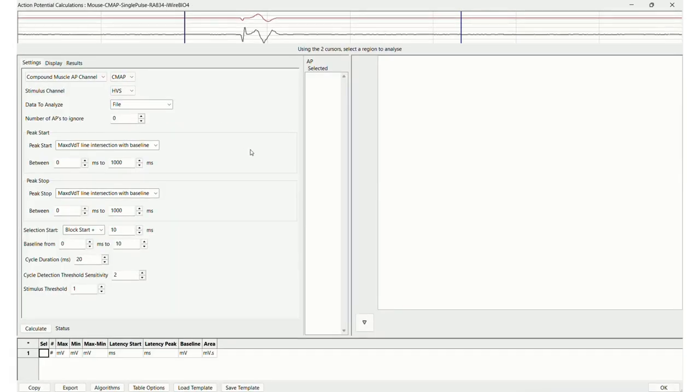At the top of the screen, the raw signal is shown in red. Beneath the raw signal, in gray, is the derivative of the raw signal. The data that was being viewed on the main screen is the data that will display in this view.